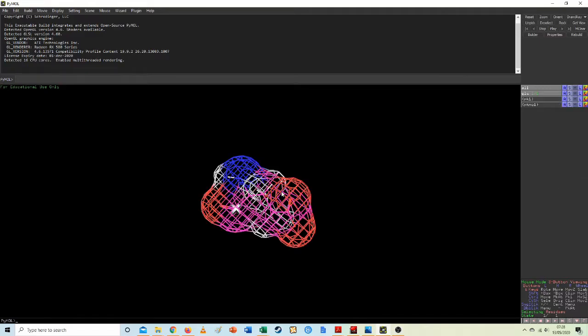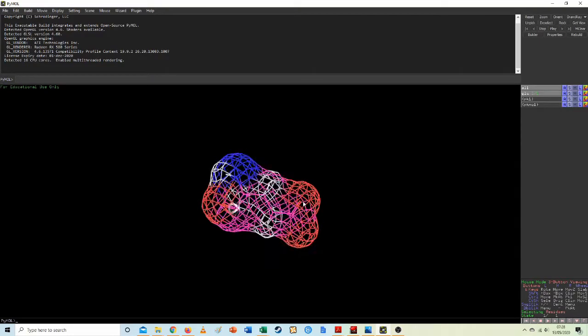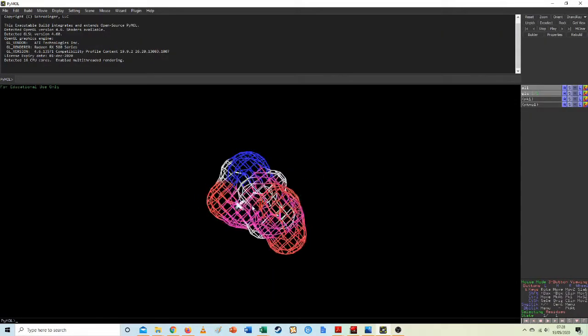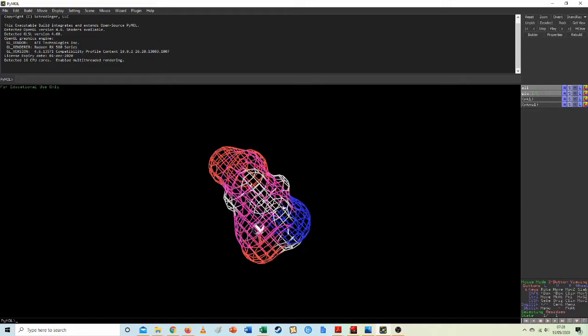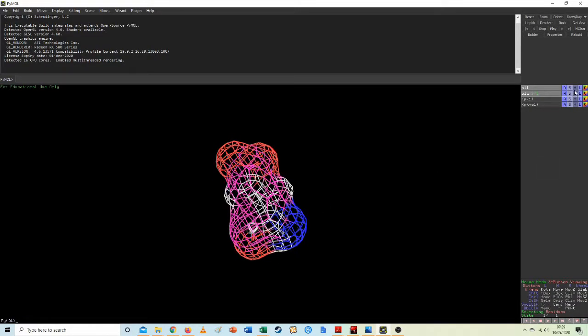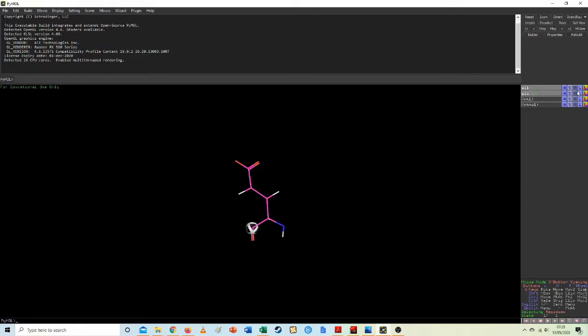Well, I've got that mesh again. I might just go for the mesh. We can see it here. In fact, it's worth orientating this a little bit so that, in fact, I'll get rid of that. Can I hide that mesh? Hide the mesh. Let's hide the mesh for now. So I'm going to rotate this round.